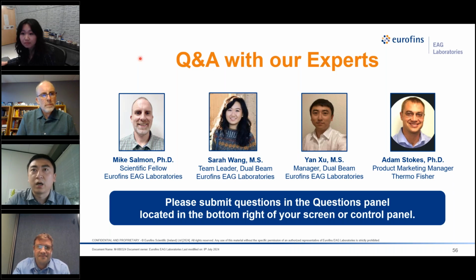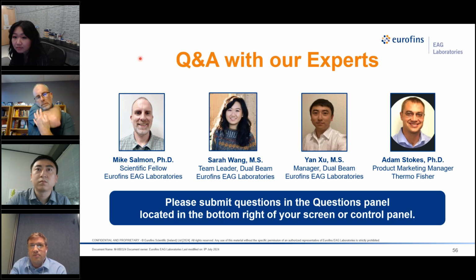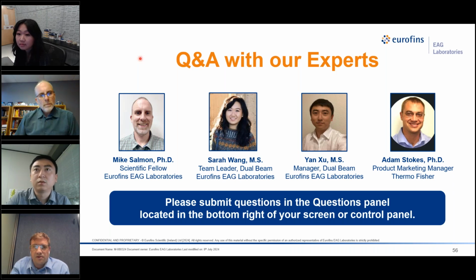Okay, thank you. And there's one more question regarding the hydro. Does the PFIB support using gas mixtures like oxygen and argon during milling? Yeah, so the primary ion species is a uniform ion species, so it's just xenon, argon, oxygen, or nitrogen, one at a time. But we can introduce different precursors during that process, like DX that Mike has been mentioning, and other proprietary chemistries as well to go in tandem with it. The primary ion species that we use normally with precursor gas is going to be xenon.